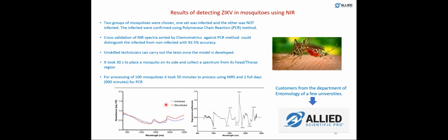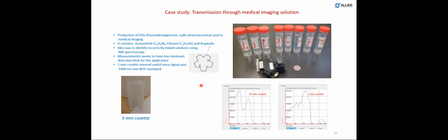Some other examples, you can use NIRvascan to detect viruses, for example, malaria, Zika virus in the mosquitoes. This has been used, the NIR, by doing the modeling. I'm going quickly through the rest of the presentation because we don't have time.